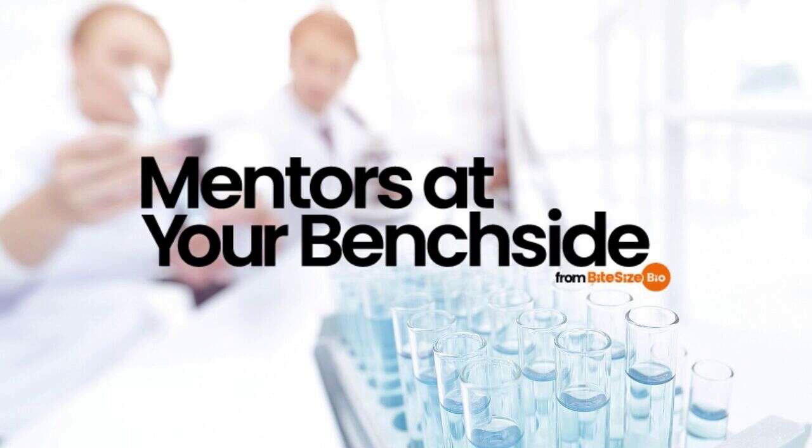Whichever way you do it, be careful, especially when thresholding. The selection of the region of interest needs to include all the relevant regions of the cell or cells. That is, every place where the probe can be expected to distribute. If you use an intensity-based method for selecting a region of interest, as in thresholding, you might inadvertently exclude relevant results. How so? Well, you could have a region of mutual exclusion where neither label appears.